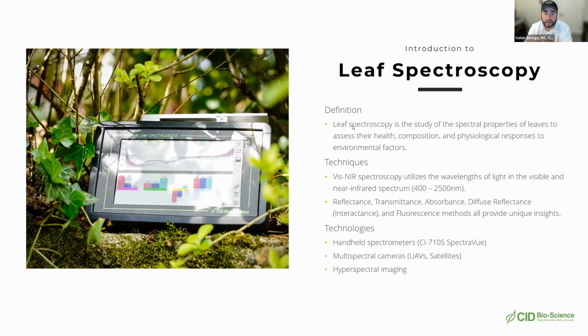The next question is, can we use it for disease in plants, for the effect of pathogens on physiological changes in plants? I'm kind of confused about what this question is asking. This can be used to model disease and look at changes in plant health status. If there is any kind of pathogen infection, you are going to see changes in the biochemical and physicochemical properties, which will impact any sort of the spectral signature.